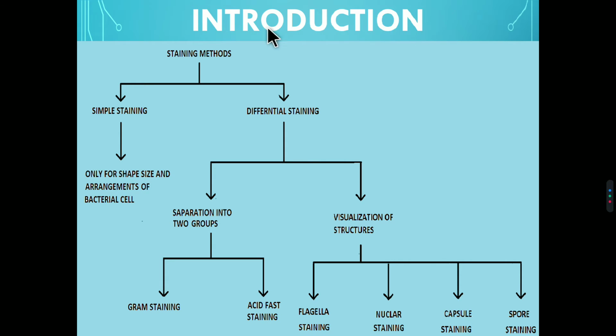The staining methods are divided into two groups: simple staining and differential staining.